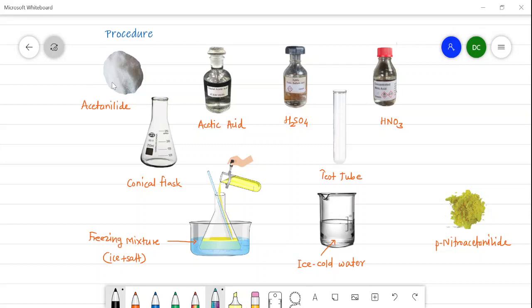See the pictorial representation of the procedure. Here is the acetanilide, which has shiny crystals, along with glacial acetic acid, concentrated sulfuric acid, nitric acid, test tubes, a conical flask, and the bath of freezing mixture which contains ice plus salt. There is also a beaker containing ice-cold water. Now we will see the actual procedure for how the reaction occurs.